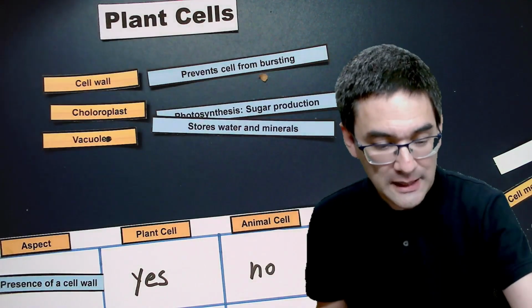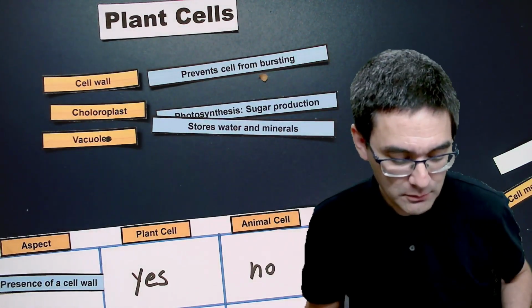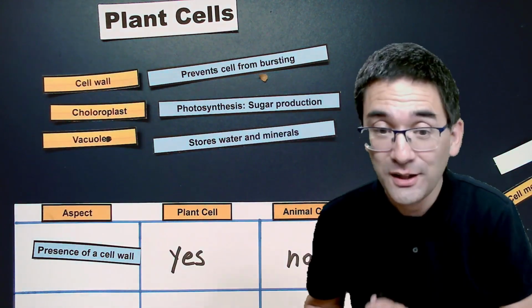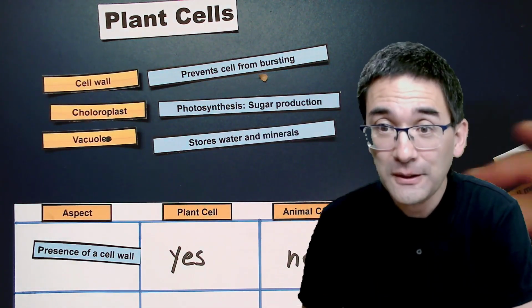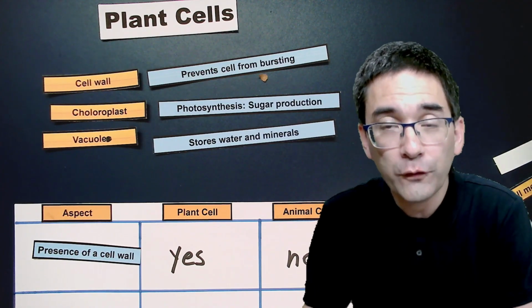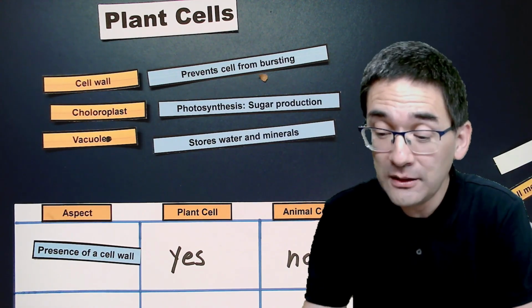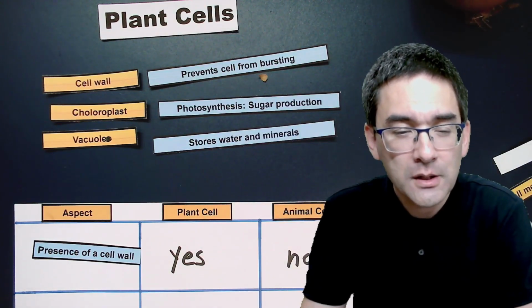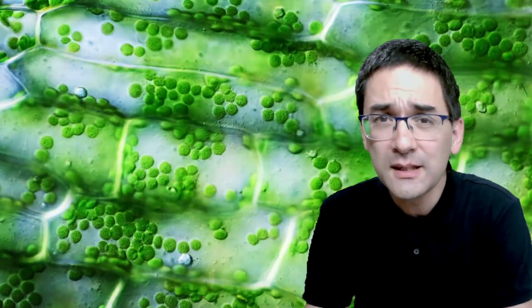Okay, so that is essentially pretty much almost everything I want to show you, because yes, you're all waiting a little bit for the things that I wanted to show you under the microscope. And I'm going to show you first some moving chloroplasts, and then we're going to put the onion under the microscope, and I'm going to show you another time-lapse video. So here are the chloroplasts. So this is from a water plant. It's time-lapse, so I made it much faster.